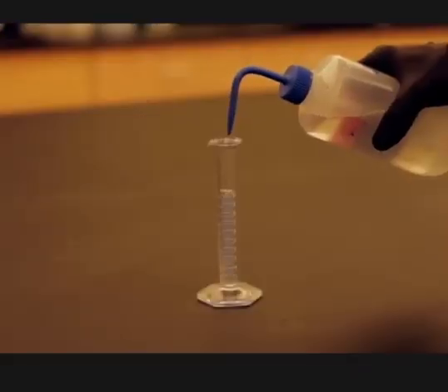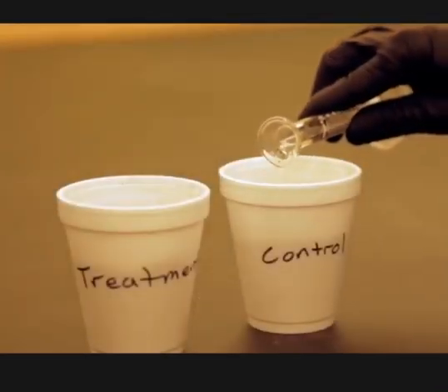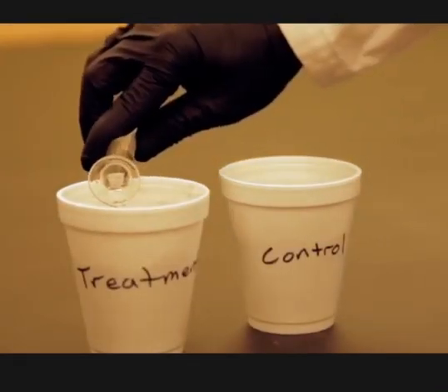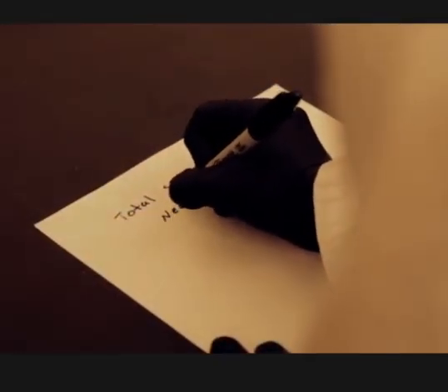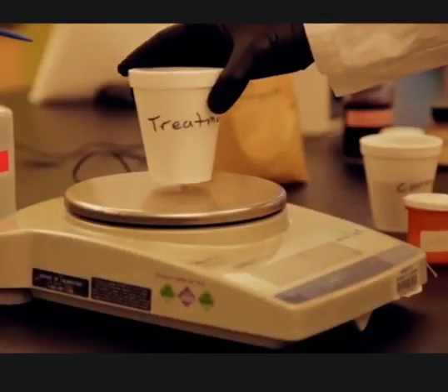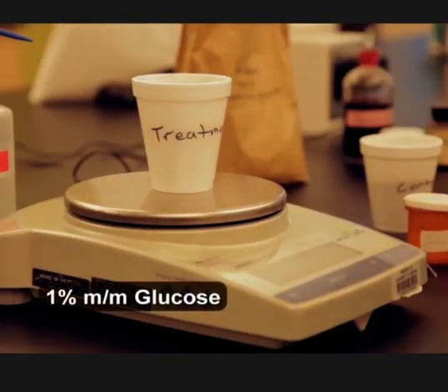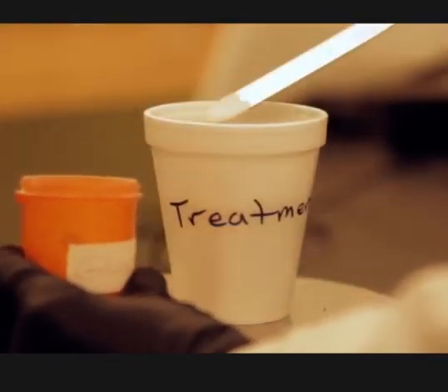Measure the calculated amount of distilled water using a graduated cylinder. Pour the calculated volume of water into each container. Based on the previously determined dry weight of the soil, calculate the amount of glucose needed to achieve a final soil glucose concentration of 1% by mass using the dry weight basis.